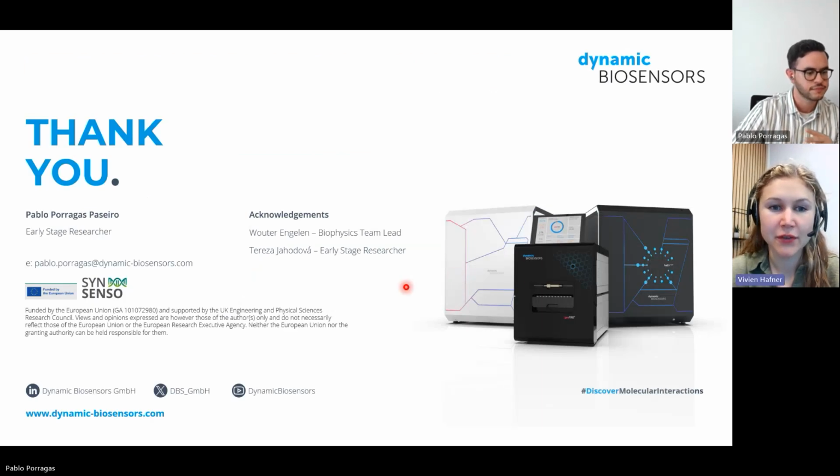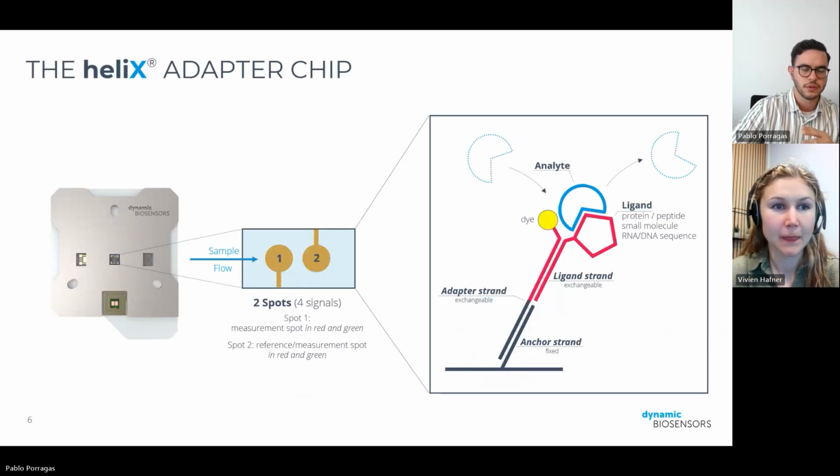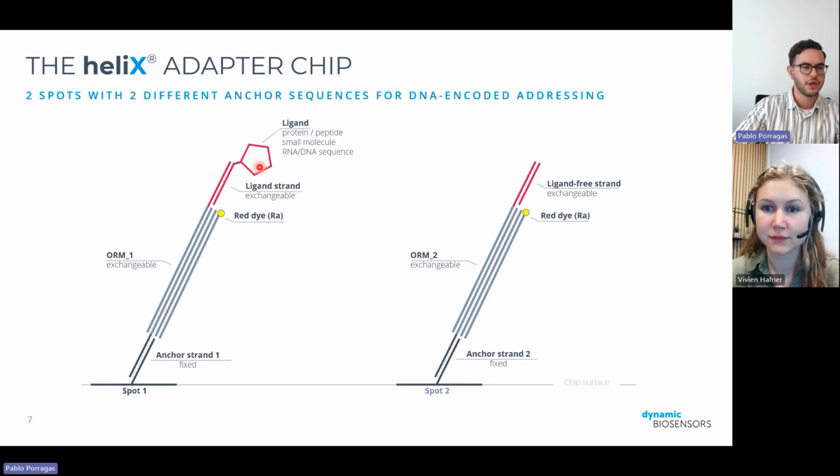And can you also use this system for molecules that aren't specifically proteins? Or is this just for proteins? Yes, in theory, we can customize the nanolever, the origami nanolever, with whatever ligand we're interested in. We've done primarily proteins because many people are interested in protein conformational change, but I've also measured a couple of aptamers using the origamis, and we can also see conformational change occurring in those aptamers.